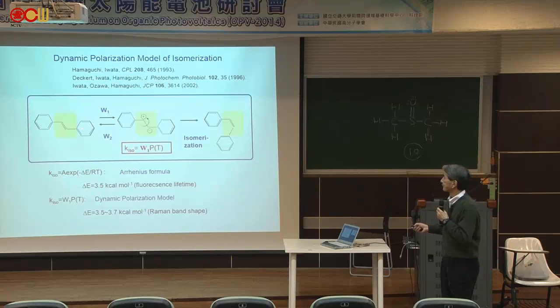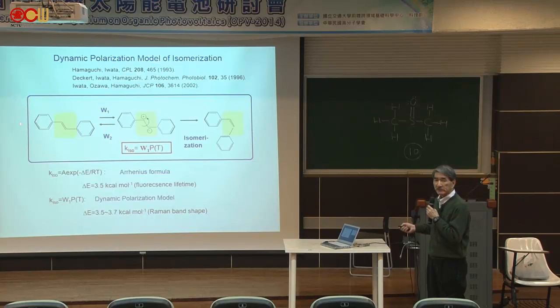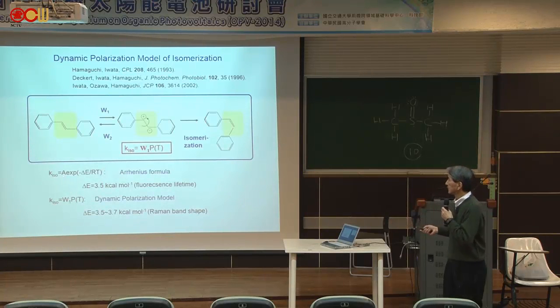And if we do Raman spectroscopy, then we observe the double bond frequency, but in hexane there are more chances of going into the single bond, so the frequency is observed lower. And if you measure it in dodecane, it does not go into the single bond so often.